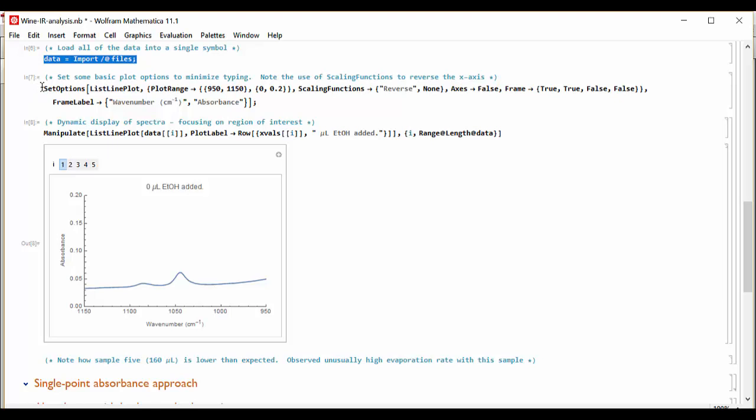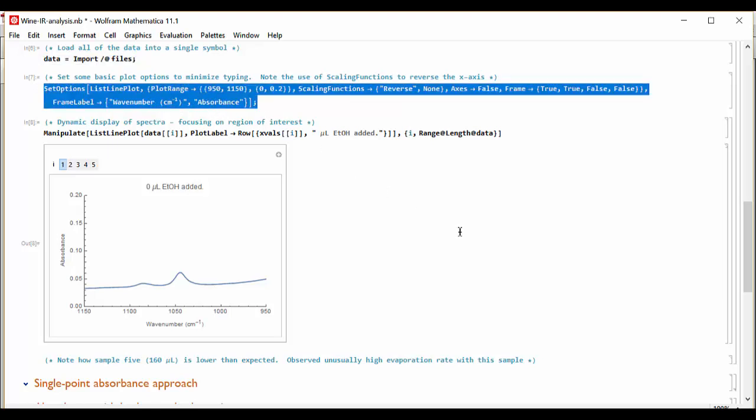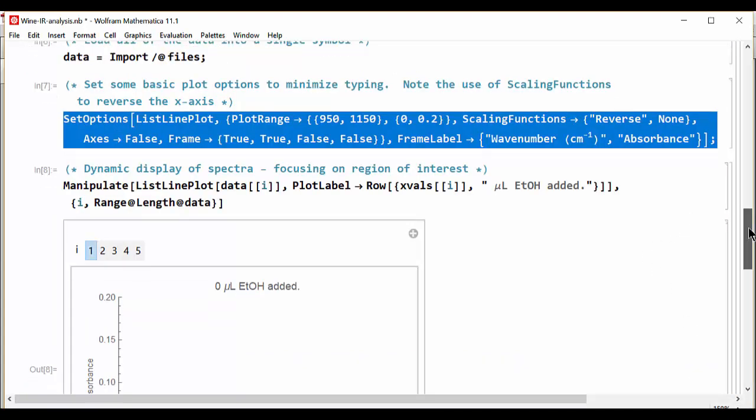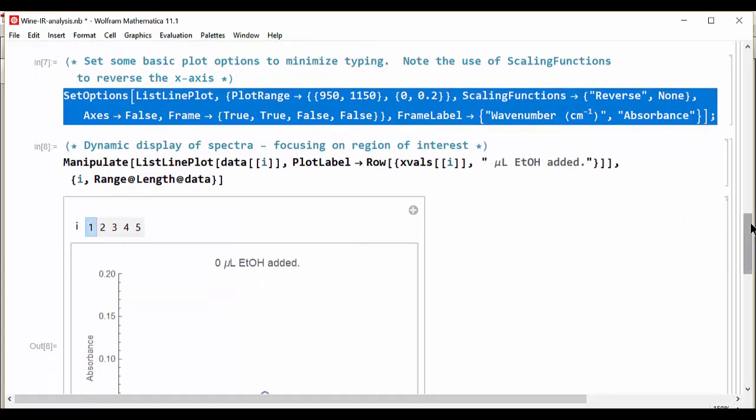Next step is to apply a couple options to the list line plot to the graphing to make the graphs look a little bit prettier. Let's see if I start blowing this up for the rest of the video, makes it a little easier to see.